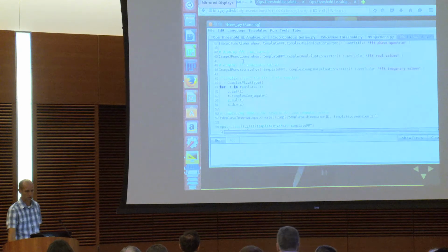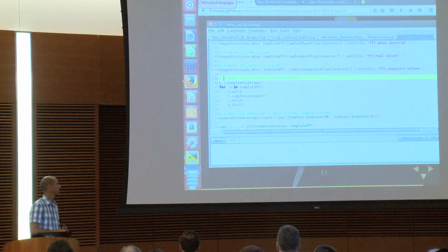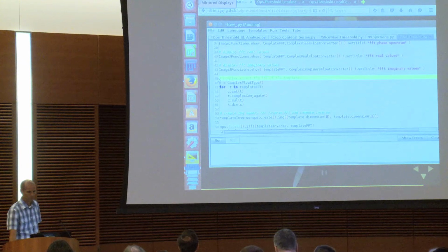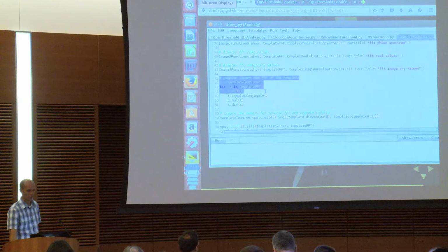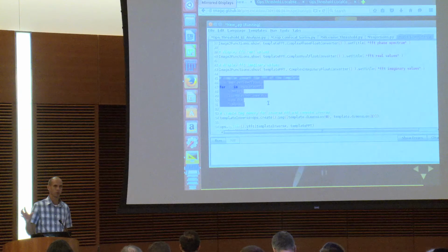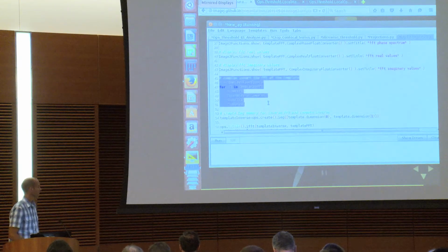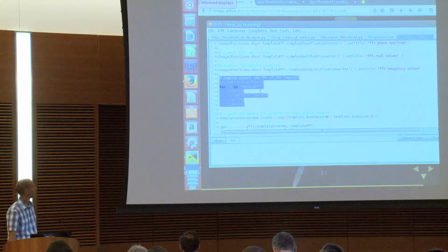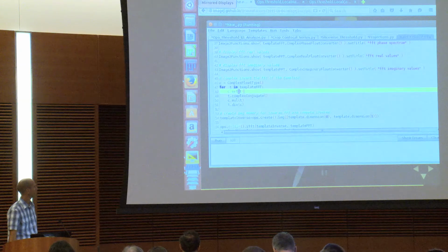And so we perform this FFT. The purpose of doing FFTs is that then you want to do some math or calculations in the Fourier transform domain. So that means we have to deal with complex numbers. This snippet of code is using ImageLib2 types. This is an ImageLib2 interface that allows us to deal with any type of number, and it has little utilities to deal with complex numbers and do complex math and all kinds of other things.